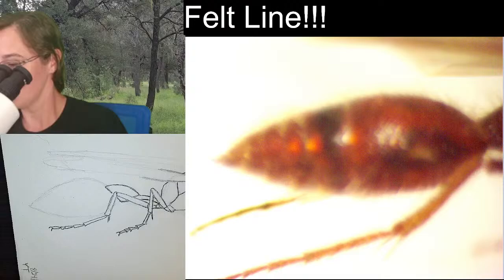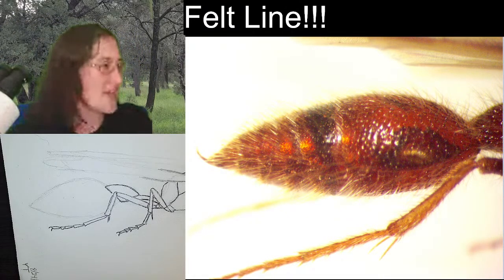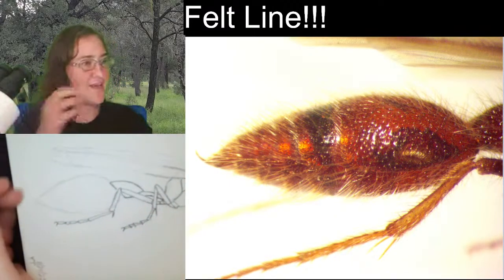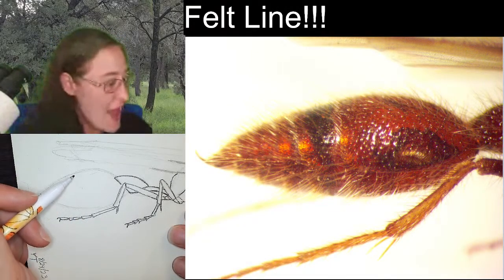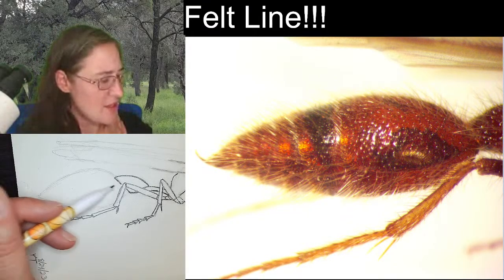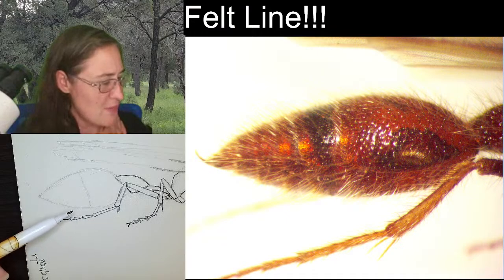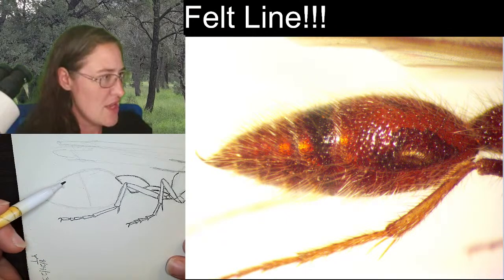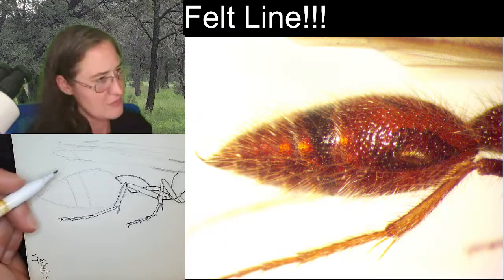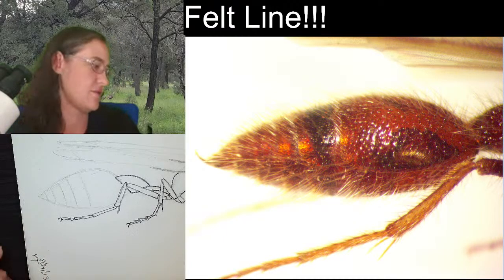One, two, three, four, five, six. I count six segments. Alrighty. The first one is obviously the largest of all of them. I'm going to go ahead and just start my light vertical lines to define segments. So this is going to be about the first segment here. The second segment is about here. And then three, four, five, six. I think that's about right.